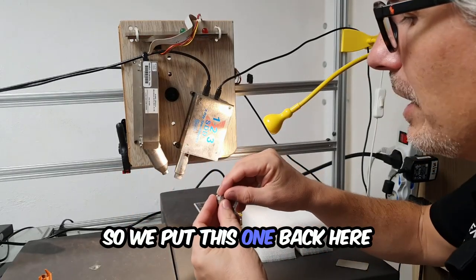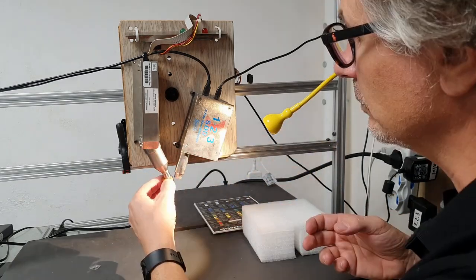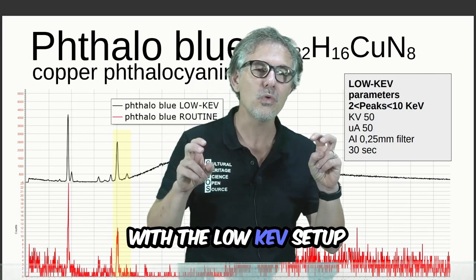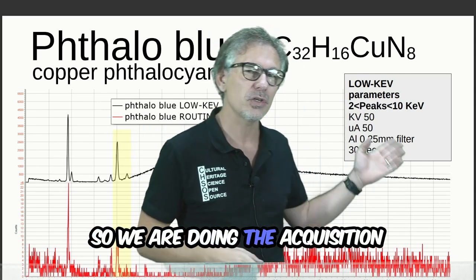We put this one back in the collimator. There it is. This is the result of the examination done with the low keV filter setup. We are doing the acquisition.